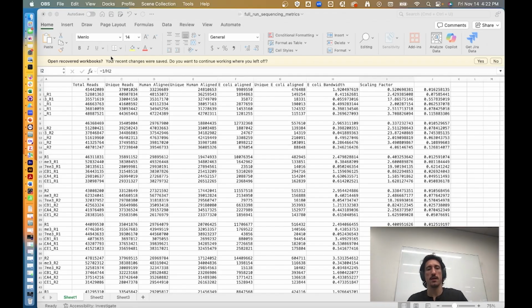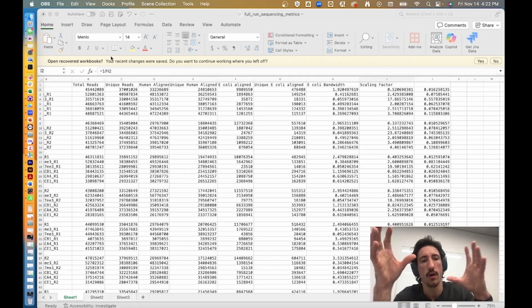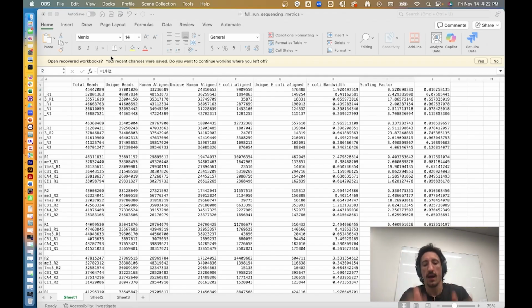So if you're starting with a ton of cookie dough and you add like 10 raisins, at the end, if you're sampling 5 cookies, you're not going to get that many raisins because you had a ton of dough to start with. However, if you add the same amount of raisins to a smaller batch and then sample another 5 cookies from the smaller batch, you're going to get more raisins per cookie.